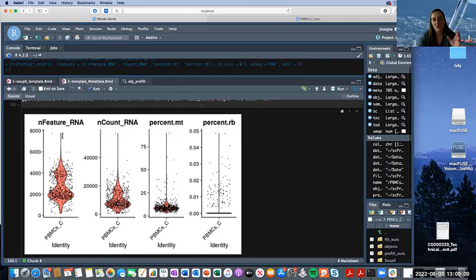That's going to really skew the data you're looking at down the line for differential gene expression and how many genes are being expressed in these cell types. Those outliers should be mostly filtered out by this point, but we don't get them all sometimes. So if you're seeing some outliers like that, you might want to set some maximum thresholds.